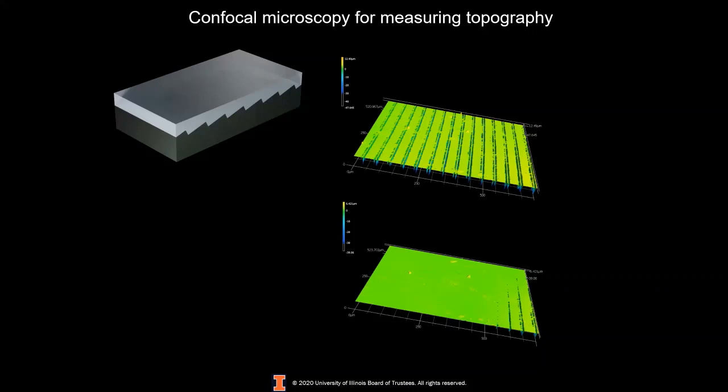It's very hard to get a sample that is completely flat. So in this case, when I was trying to include the top surface on this end over here, I was already reaching the substrate over there.